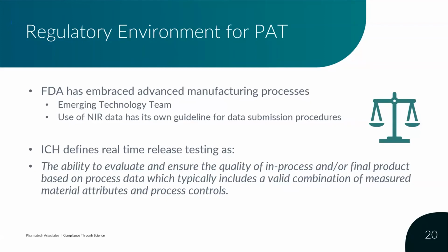So you can have process analytical technology, but not use that data to release. You can still take your samples and send them to the lab and go that way. However, it's unlikely that real-time release testing could be implemented without process analytical technology. In fact, I don't see how you could if you have no data other than manual sampling.